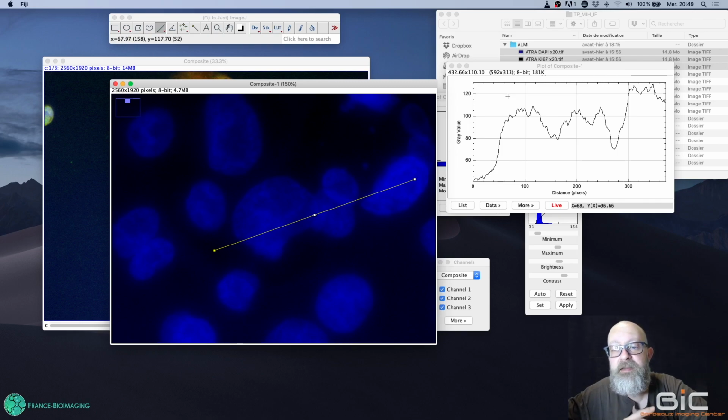So let's imagine that I want to separate the background pixels from the pixels constitutive of the nuclei. The thing I could do is set a certain limit, a certain minimum intensity that you should have to be considered as a pixel belonging to nuclei. Let's imagine that I set the intensity here.